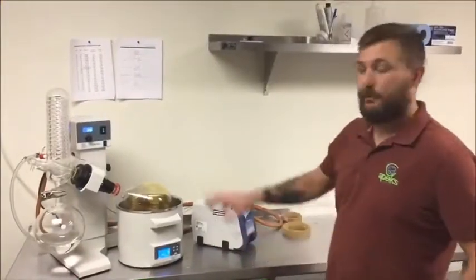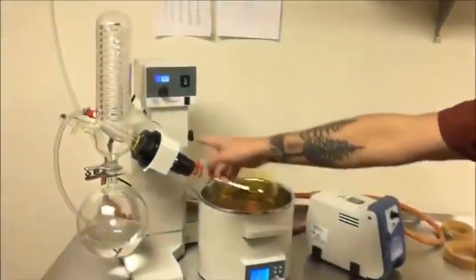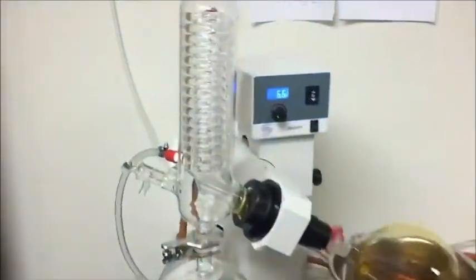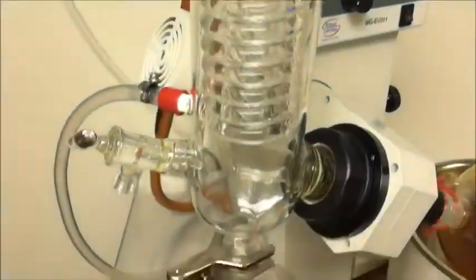Okay, so here we are about 30 minutes in. As you can see, coming a little closer. Here our ethanol is condensing on those cold coils like we talked about. It's dripping down. So here's all the ethanol we've recovered so far. This is great ethanol we'll be using again.